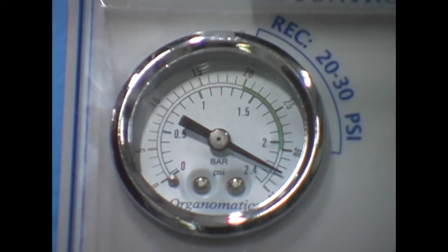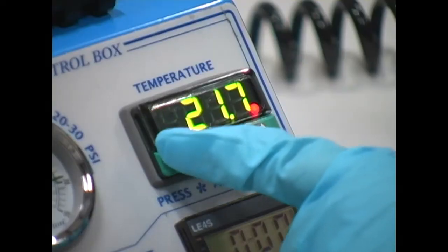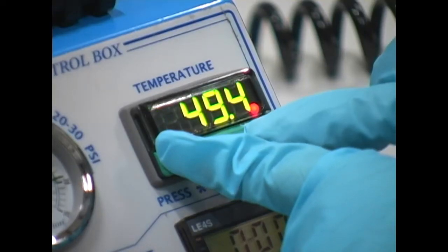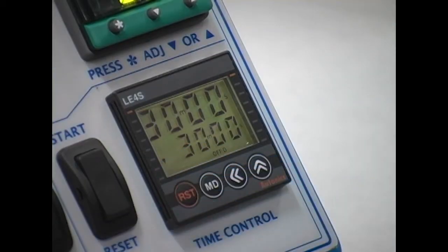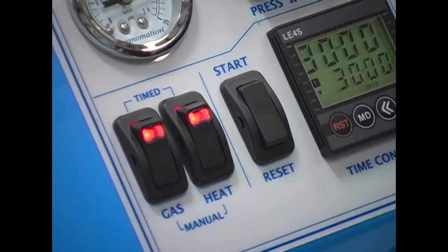The automatic 20 position Enovat comes with a digital control system to control the gas flow and water bath temperature. Simply set the timer and the instrument will raise the samples and turn the heat and gas off once the time cycle has been completed.